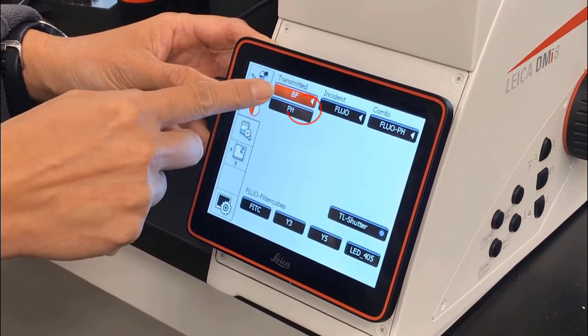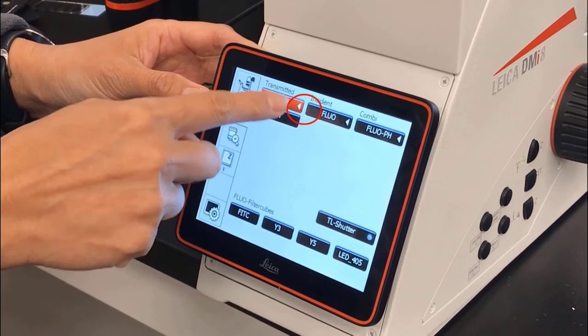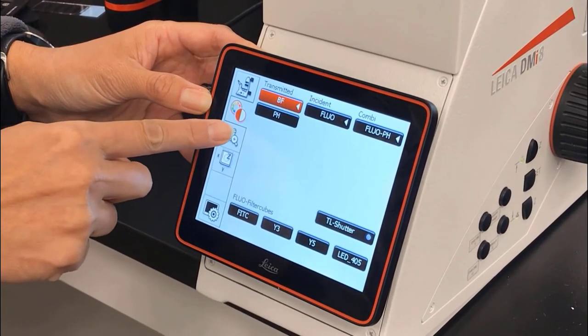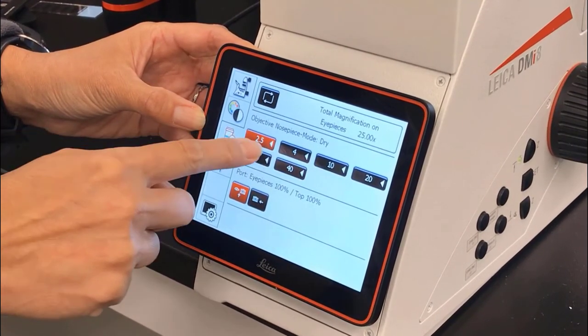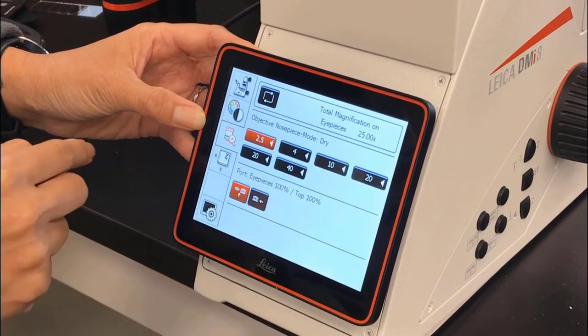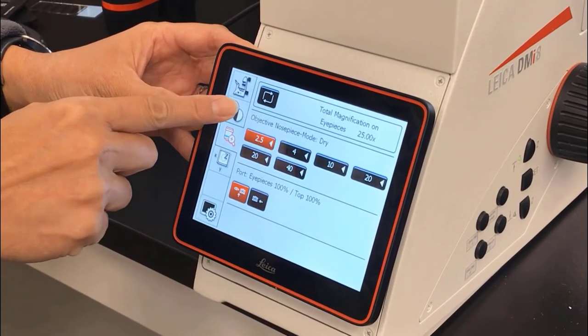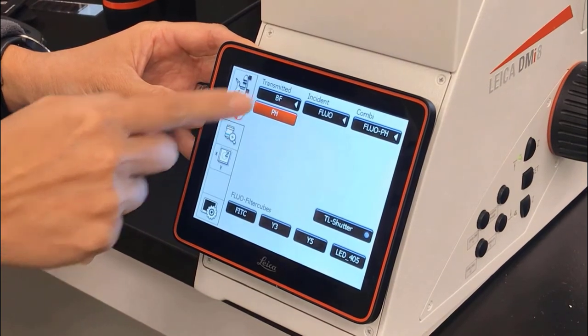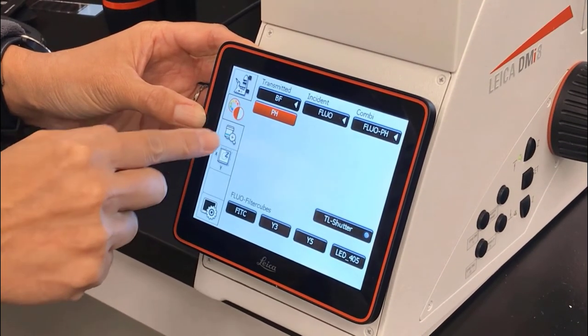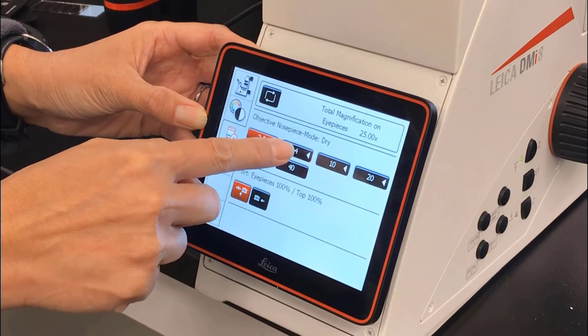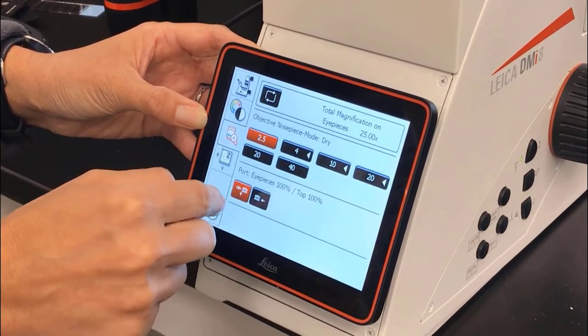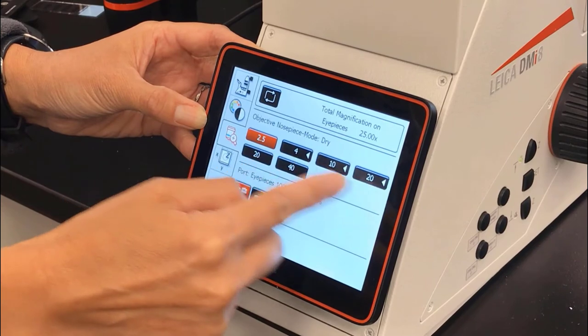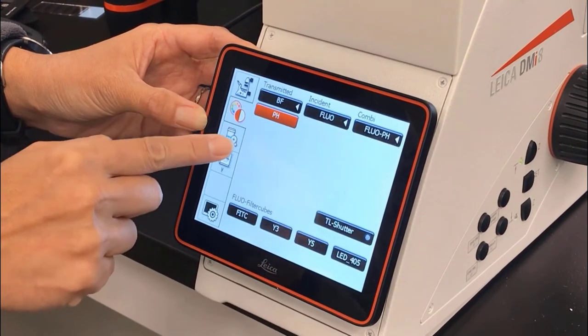You'll notice there's a little caret next to the bright field button, which indicates that all of these objectives are available for bright field imaging. If we're interested in doing phase but there's no caret, that means the current objective can't do phase. So we go back to the objective tab and it says the 4, 10, and 20 are all available for phase. We can choose any of these three for phase imaging.